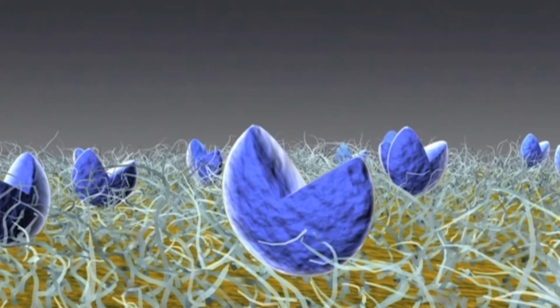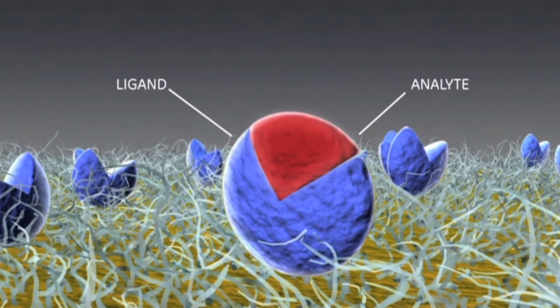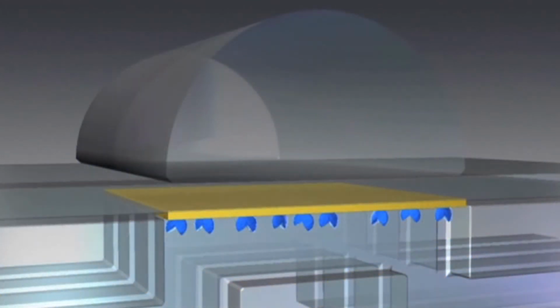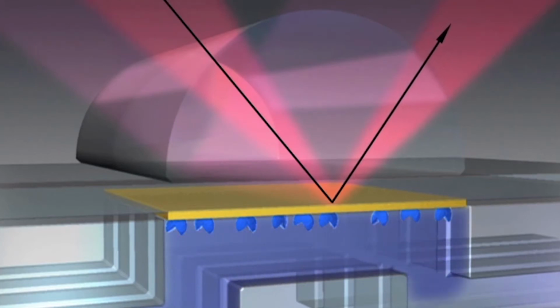So one binding partner is attached to the surface of a sensor chip, and the other is injected in a continuous flow of solution. Whatever the nature of the molecules involved, we call the attached interacting partner the ligand, and the partner in solution the analyte. Biacore uses the phenomenon of surface plasmon resonance to detect biomolecular interactions as they happen.